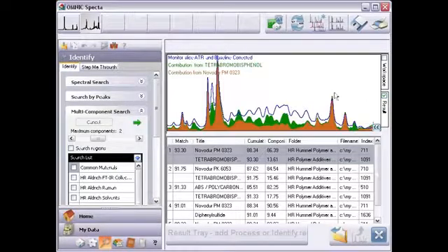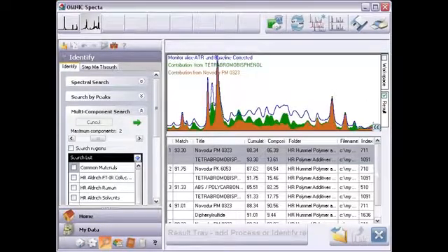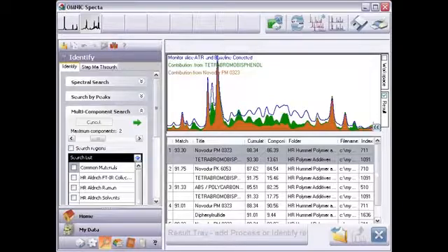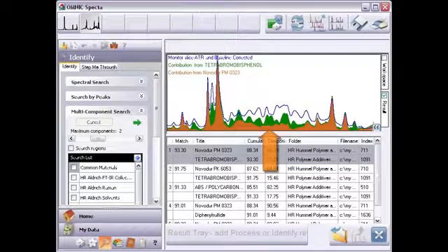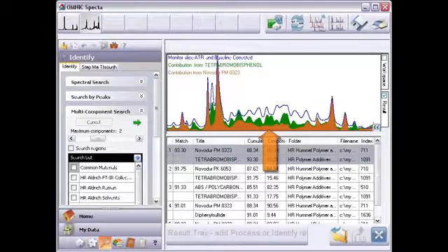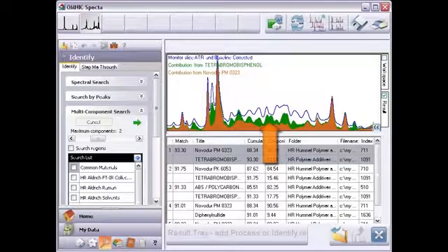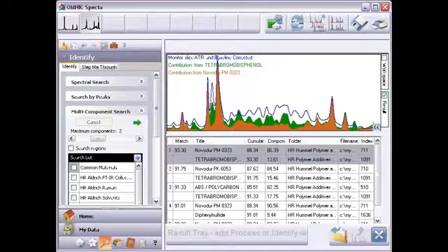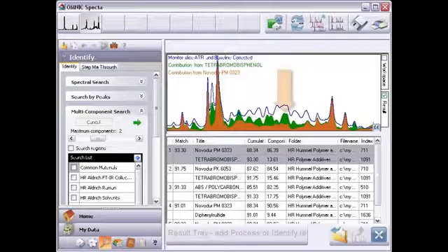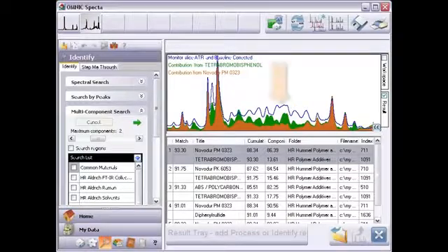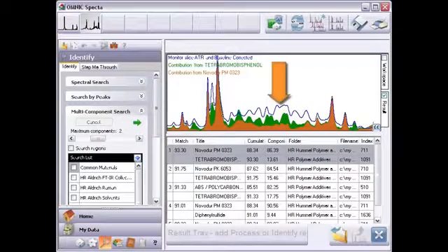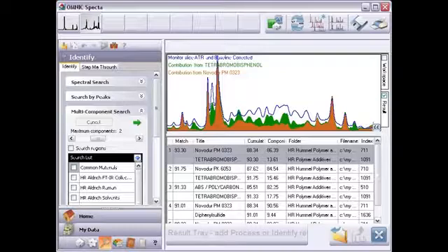Now I'll select terrain view, which shows the contribution of each found reference to the composite and compares it with the unknown. The bottom color represents the contribution of the first major component in the match set, the base plastic. The next layer shows the additional contribution from the second component. So at a given point, we add the contribution from the first and second component to get their combined contribution. The top edge of this layer is equivalent to the composite spectrum. The solid line at the top is the original spectrum of the unknown sample. Again, you can see how each component contributes and how the composite accounts for all the major peaks.